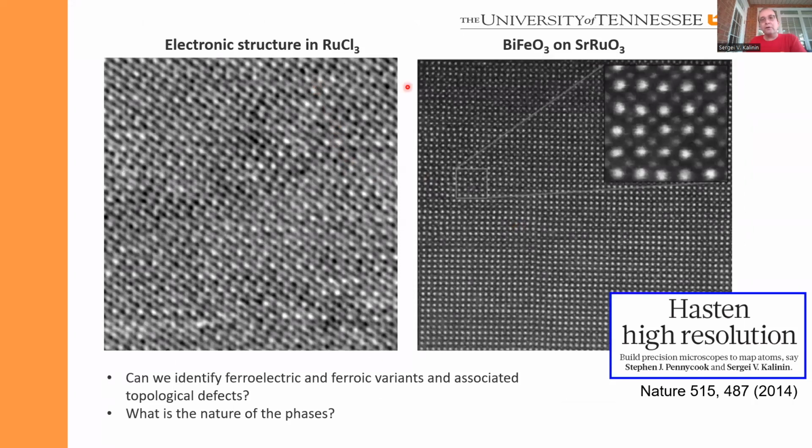So these are two images of a nominally single crystal system. This one is actually not electron microscopy. This is scanning tunneling microscopy, but it illustrates the principle of looking at the image and seeing that there are clearly some details here. If you look at this image carefully, you can see there is a difference between the intensity of the individual spots.